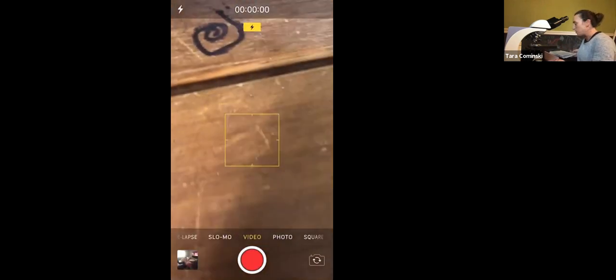All right, so anyway, you can answer number 4 and 5 on page 21 under inversion as well. Obviously when you're looking under the microscope, everything is inverted and it's opposite. The other thing I wanted to show you, I mentioned the parfocal thing, but I just want to show you what happens when I switch to higher power.